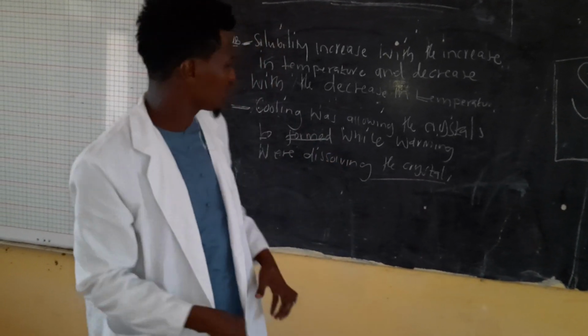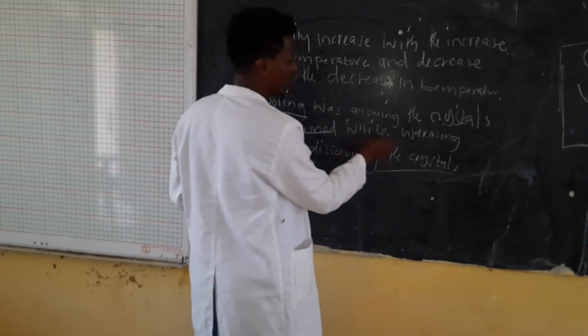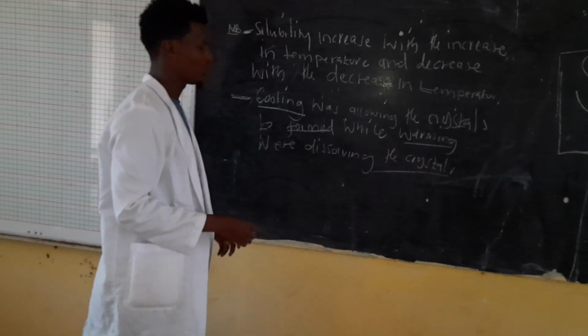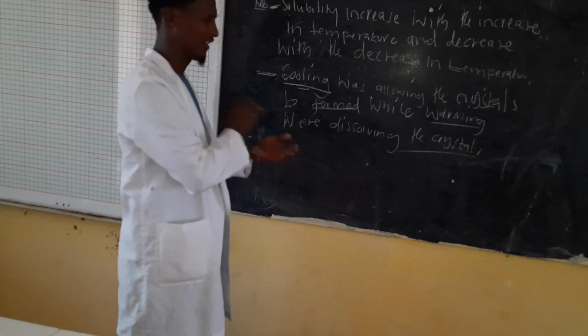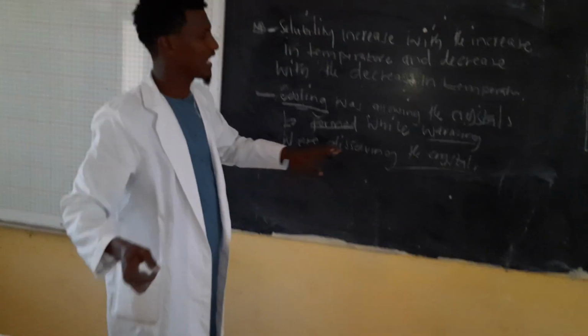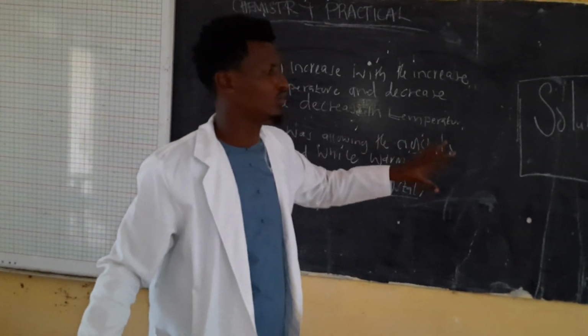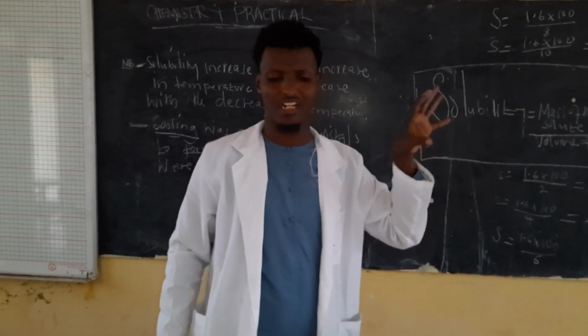They were forming. So cooling forms the crystals, and warming or heating dissolves the crystals. So that is how you need to know the solubility.